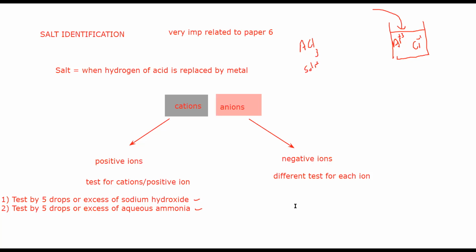So for negative ions, there are different tests to check the negative ion.